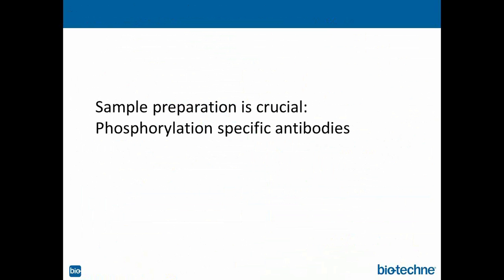Okay. Sample preparation. There's been a lot of work in-house on making sure that the sample preparation is really meeting our criteria and making sure that what we send into the assays is going to give us the right result, and we're not misinterpreting any results we're getting. So why is this crucial?